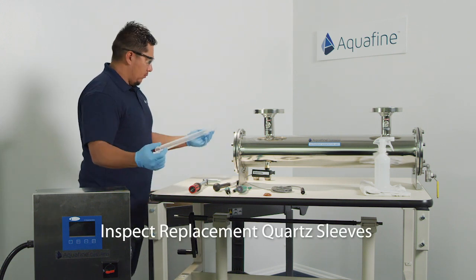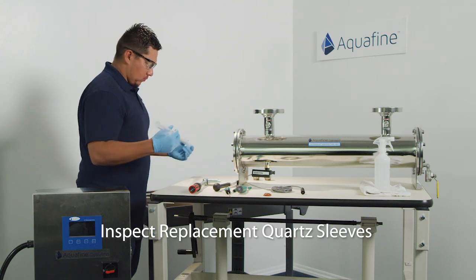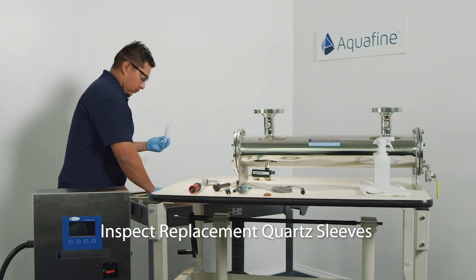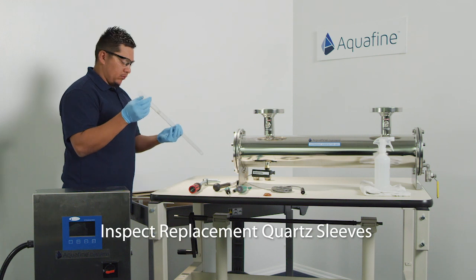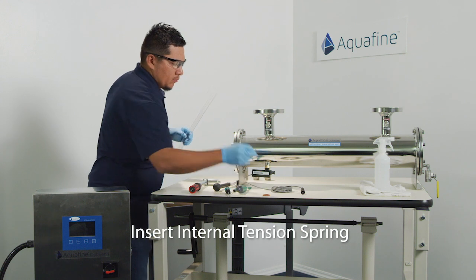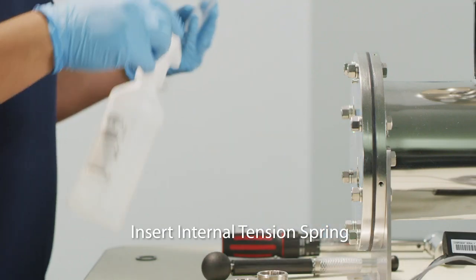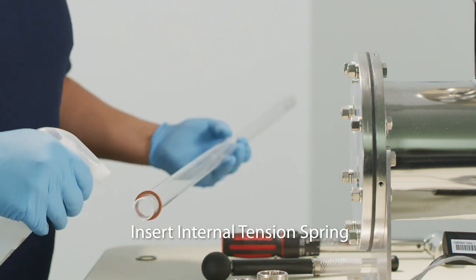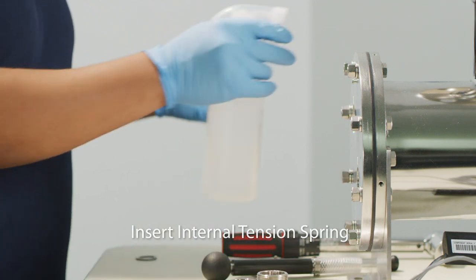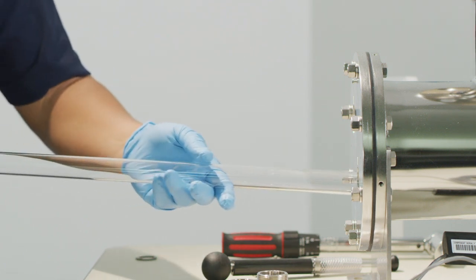Prior to installing new quartz sleeves, it is recommended to inspect the replacement for any possible cracks that may have occurred during shipment. With the quartz sleeve free of cracks, proceed with installation. Insert the internal tension spring through the open end of the quartz and ensure the spring slides to the domed end of the quartz sleeve. Take time to also add the primary sealing O-ring at approximately 1.5 inches from the open end of the quartz sleeve.